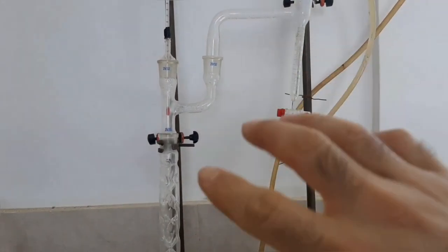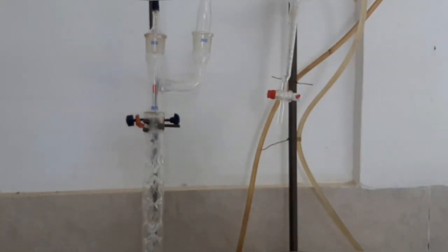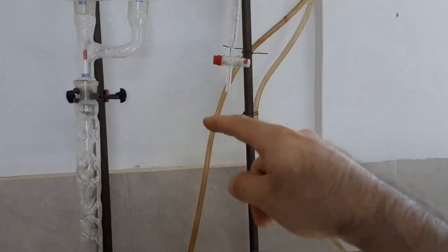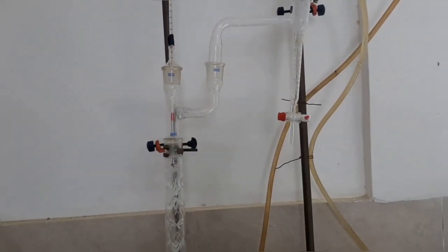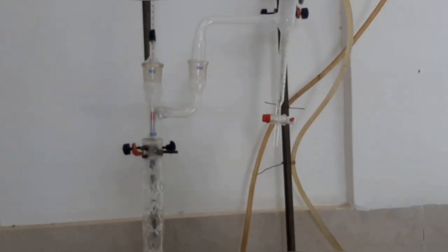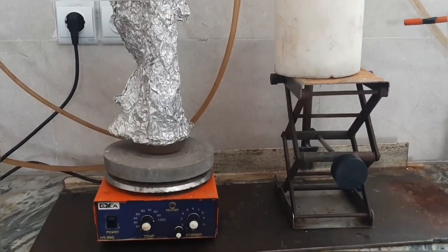So the Dean-Stark apparatus here helps us reflux some of the overhead product. The way the Dean-Stark apparatus works is that it will reflux through the arm here, through the distillation column, and it will keep the temperature of the top of the column fairly constant. So the ternary azeotrope boils at around 67 degrees Celsius, so we need to keep a steady temperature at the top of the distillation column. So overall, this system will give us a semi-continuous process of distillation, and let's see what happens.